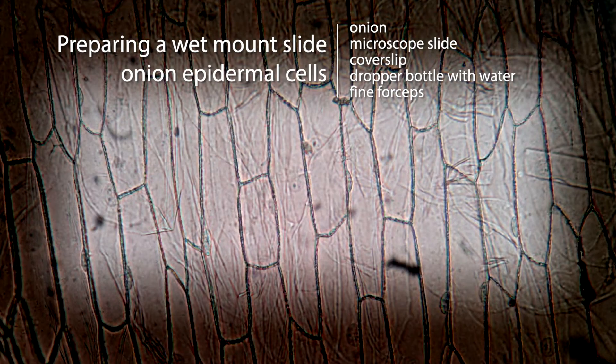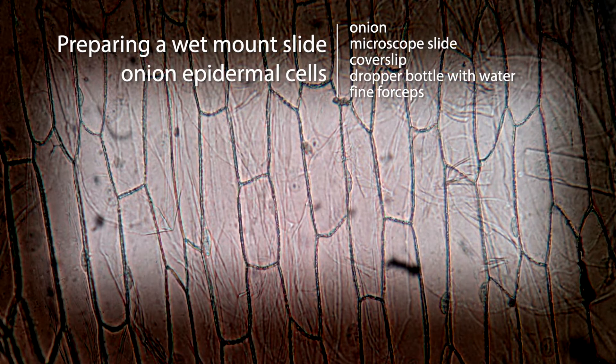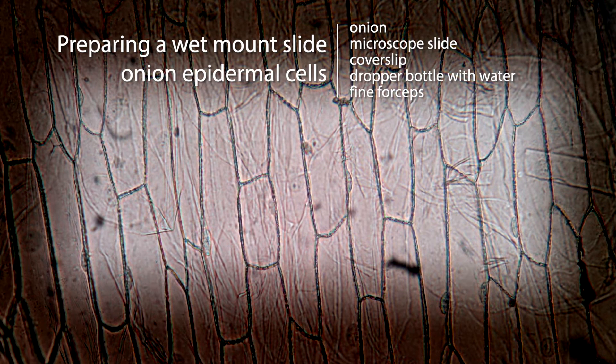Hello and welcome to the tutorial video for preparing a wet mount slide of onion epidermal cells.